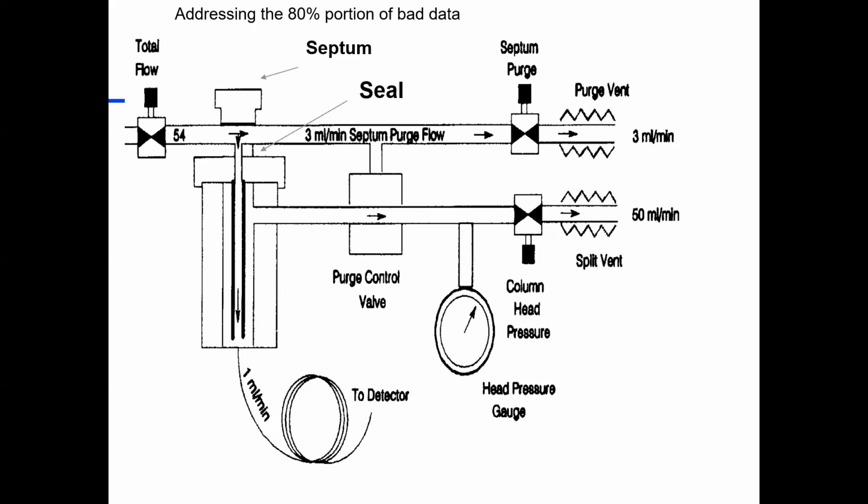We've got a glass tube in here where we really want to see our heating and vaporization occur in our sample, but it's connected to metal. We don't connect glass to metal very readily. And so there's typically a rubber O-ring up here. And if that rubber O-ring hasn't been changed for a while, and believe me, we have seen cases where it almost turned into dust before somebody realized they could actually fix it. So there's again an opportunity for a leak up here, a leak around the injection port.